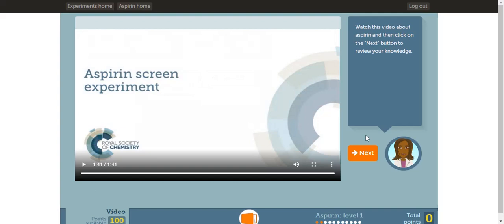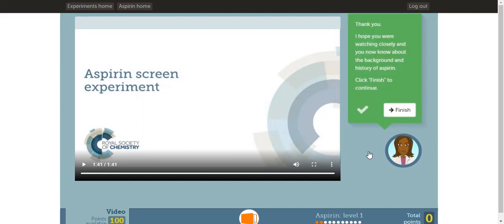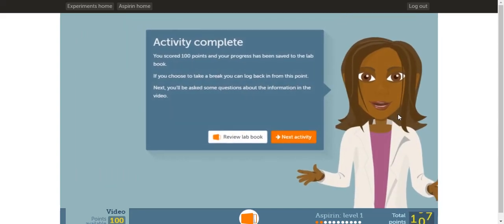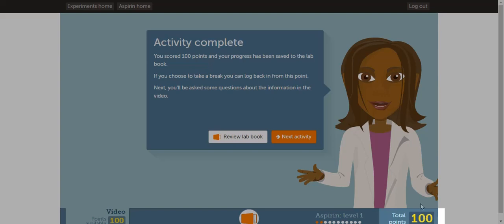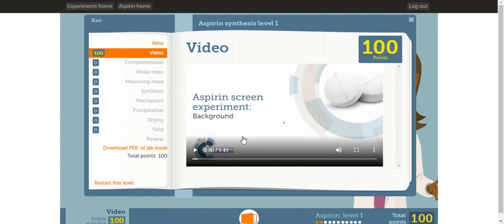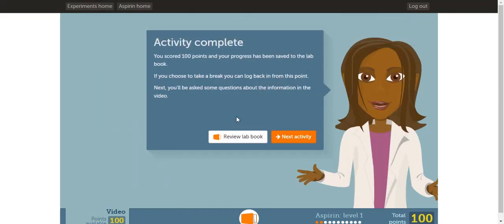You can watch the video as many times as you want. Once you're ready, click next. If you look at the bottom of the page, you receive 100 points for watching the video. You can click review lab book to check what you have done. Once you're ready, click next activity.